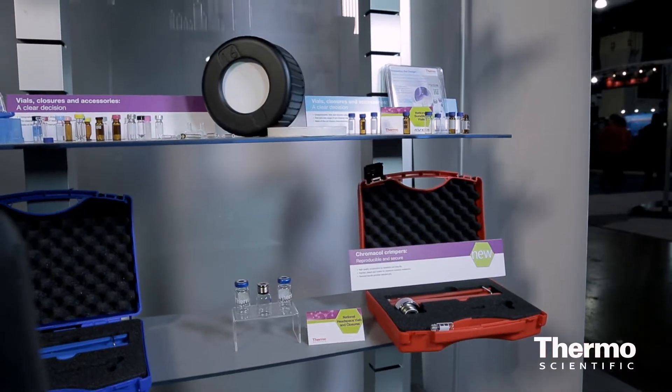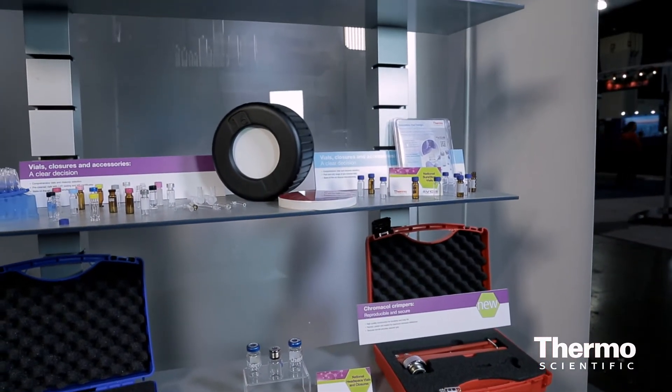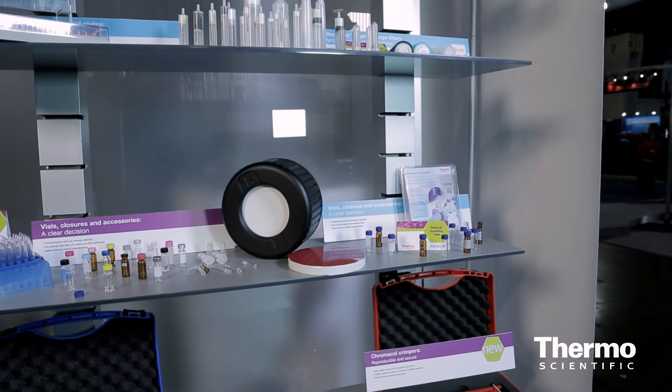We know that our sample handling customers care about their sample integrity and maintaining that. Therefore they're concerned about things like SEPTA push through, evaporation, or anything that's going to interrupt their run. So we've introduced two products as part of our AVCS, or Advanced Vial Closure System.